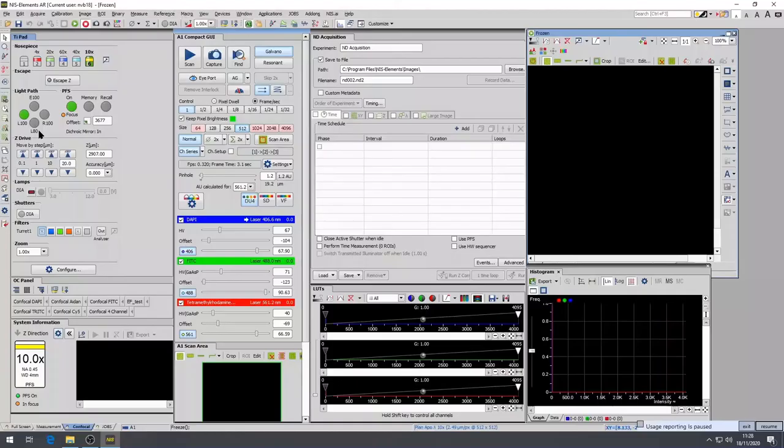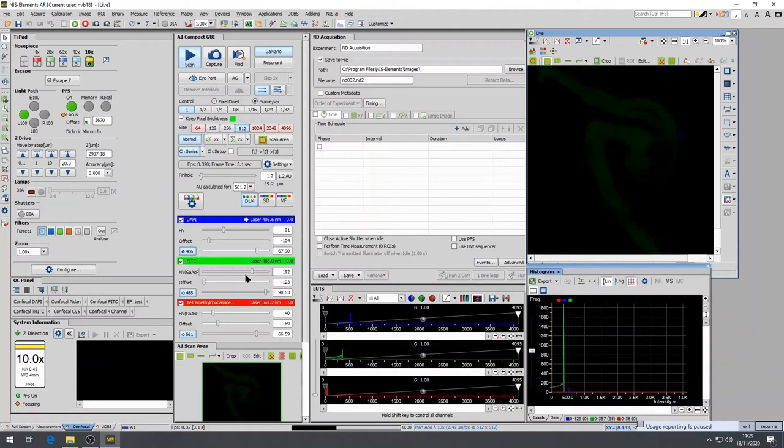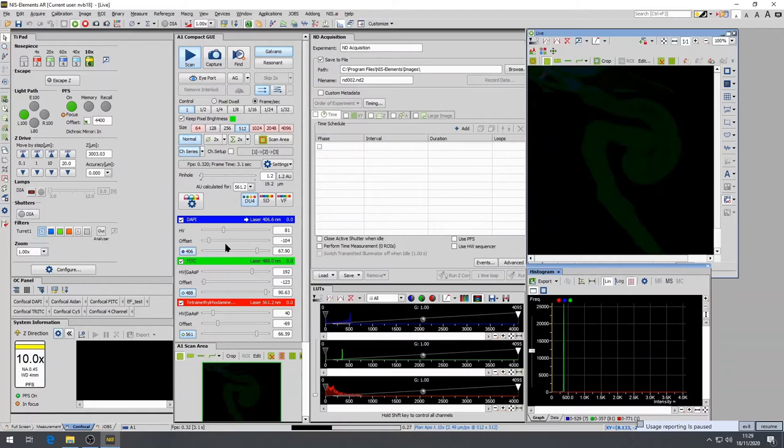If you have not set up the scan settings, the scan will automatically default to the previous scan settings. The default setting is to scan usually all laser lines simultaneously. This reduces the scan time, but increases the chance of channels bleeding through into each other. For this instance, you can see the DAPI, FITC and TRITC channels are scanned at the same time.